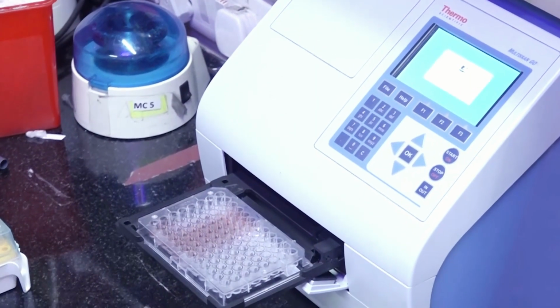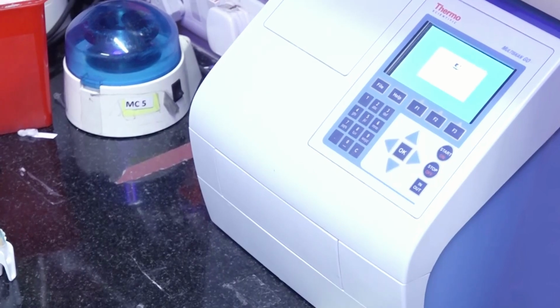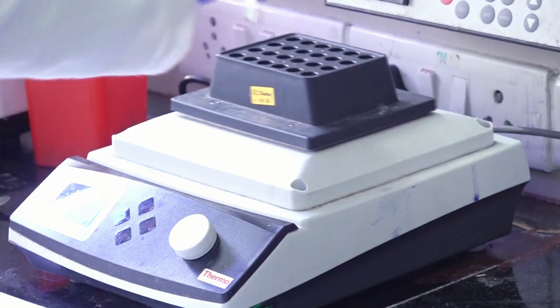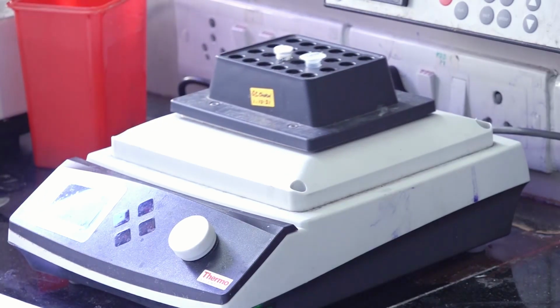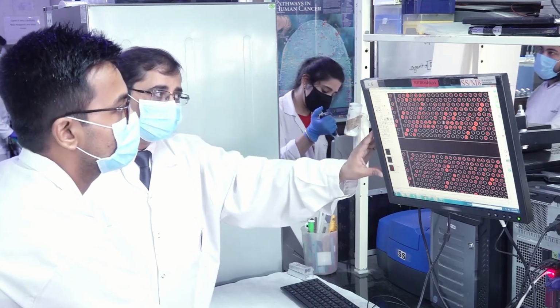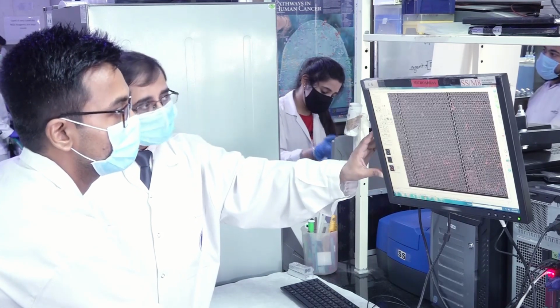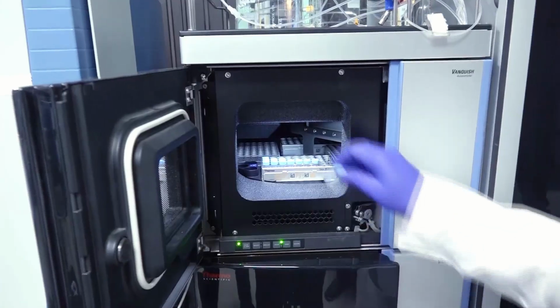So any biomolecular discovery program from diagnostic to looking at prognostic and therapeutic value requires extensive discovery as well as validation work and it cannot be achieved by just one platform. Therefore, we are very much open to utilizing different types of technologies, different platforms and mass spectrometers. We also utilize microarrays, surface plasmon resonance and other assays to validate our biomarkers.